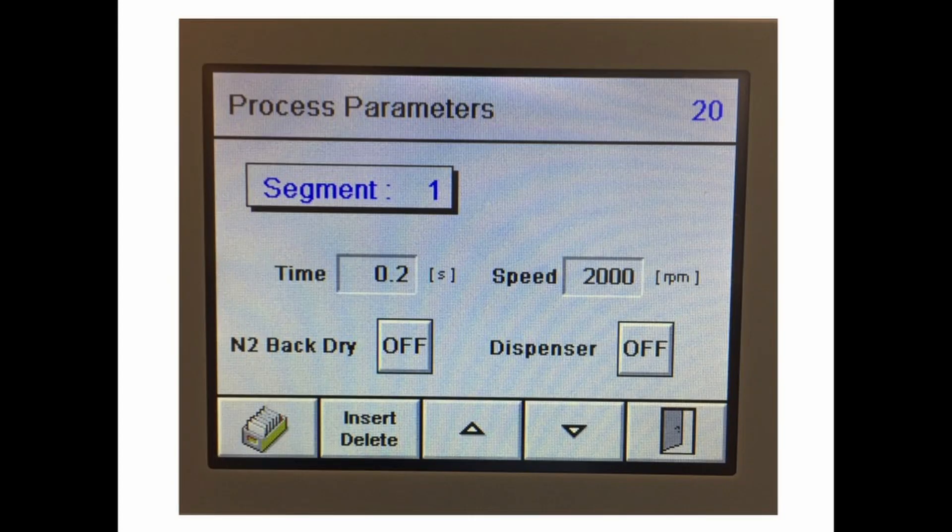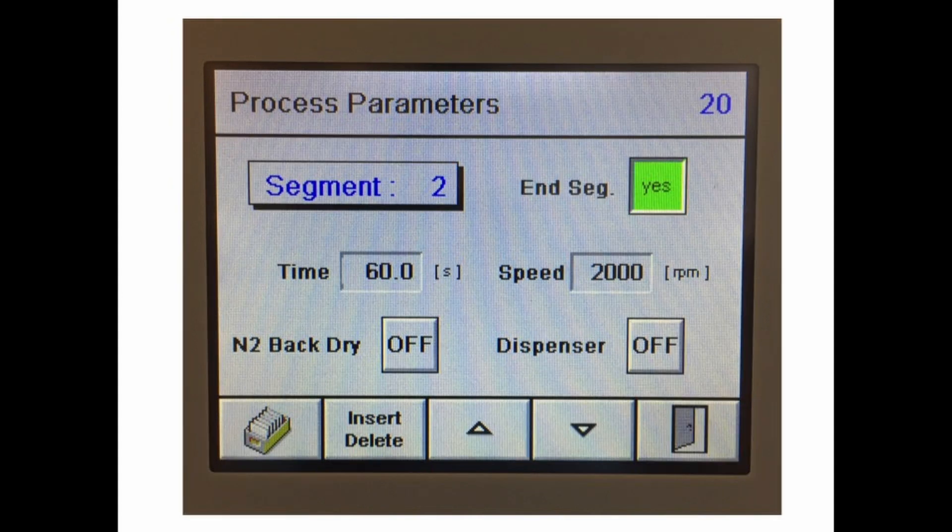The spin coating recipe is broken into individual segments. The first segment is used to define the acceleration of the spin coater, while all subsequent segments have a defined speed and duration.